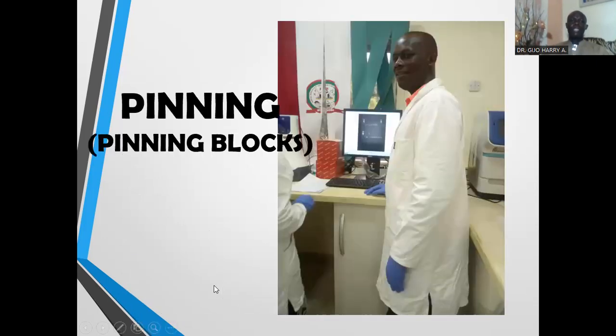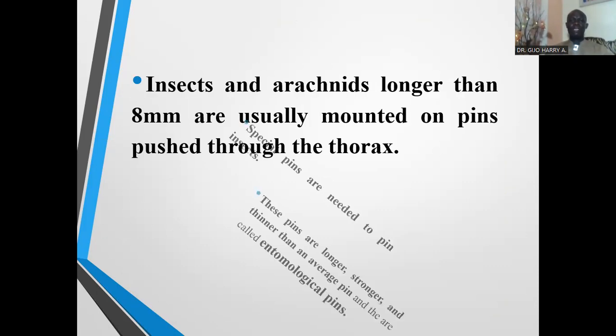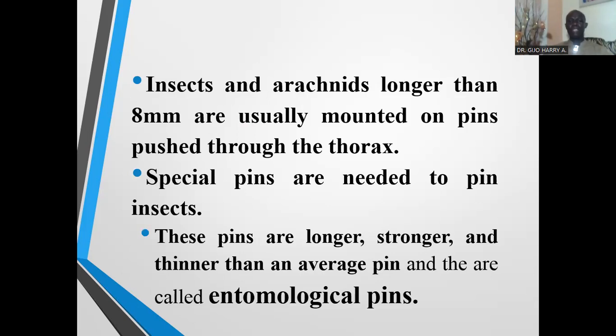Now I want to look at pinning, how to pin an insect to preserve it, or the use of pinning blocks to preserve insects. Insects and arachnids longer than 8 millimeters are usually mounted on pins pushed through their thorax. The thorax is the region that corresponds to the chest of humans. The middle of the insects is where the pins are introduced to preserve these insects.